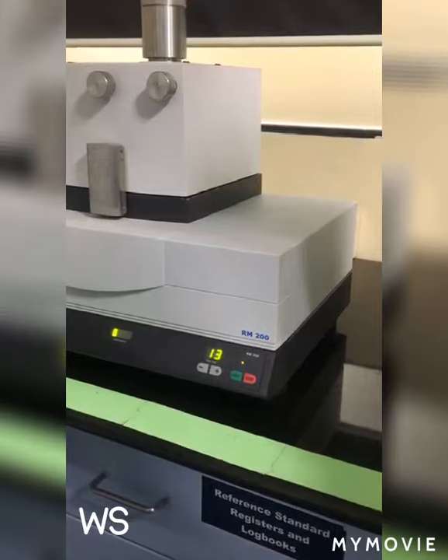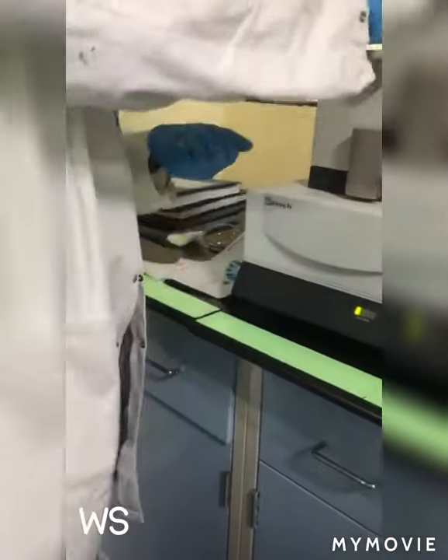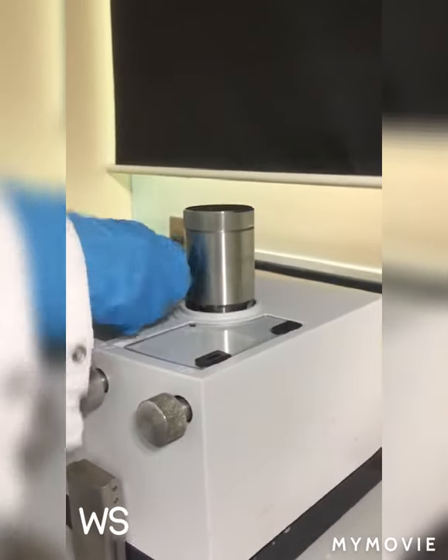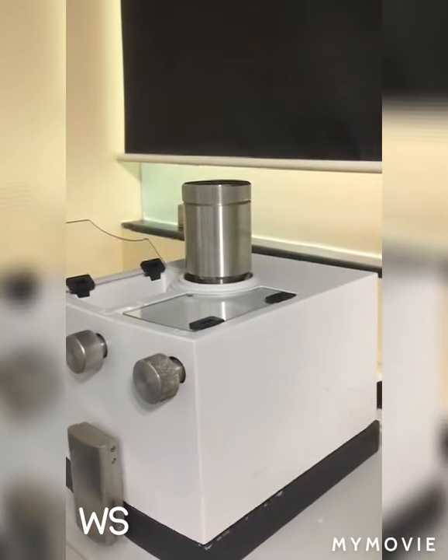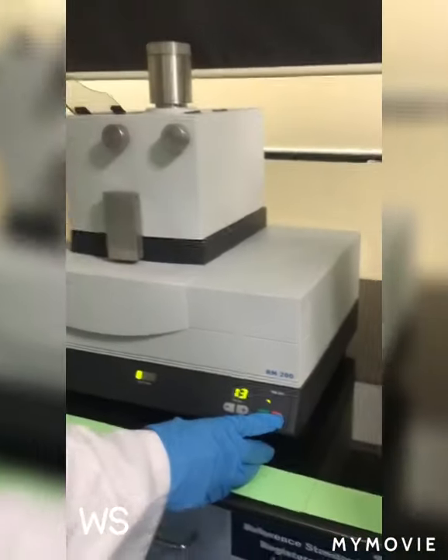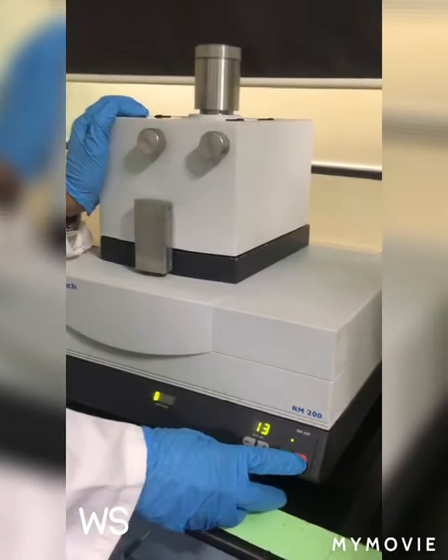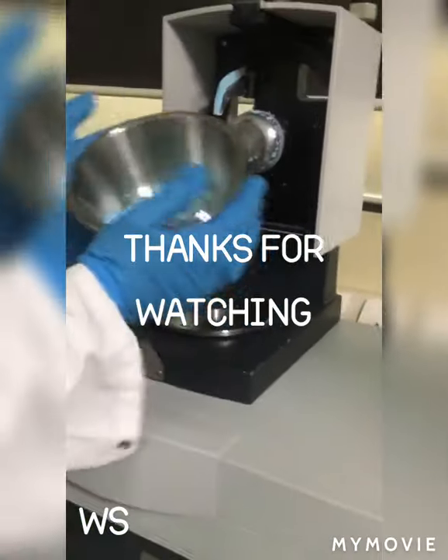Suppose you have like 10 tablets. If the film-coated tablets are there, I will put them in from here. Before, the tablet was like this, and if I want very fine powder, then I will push it to the wall of our mortar. So now it is done.